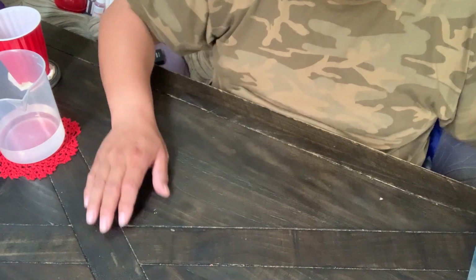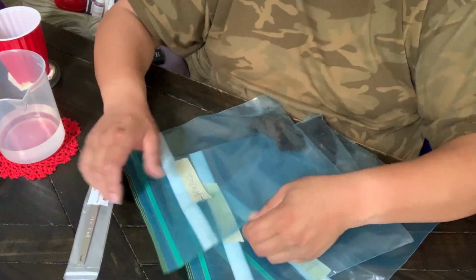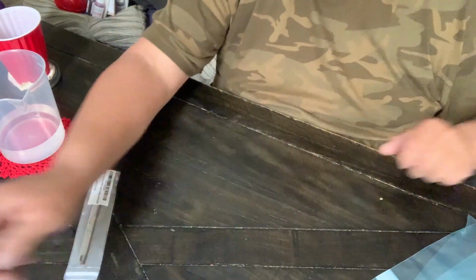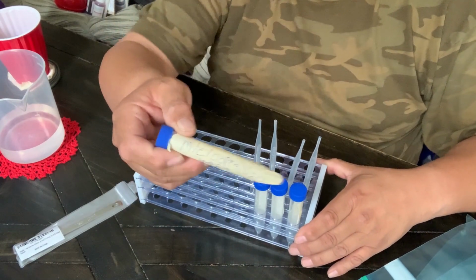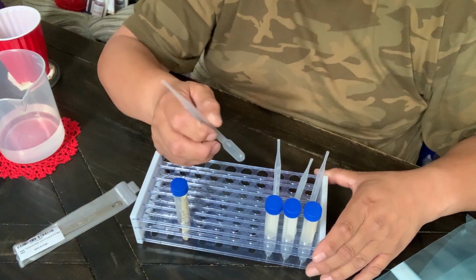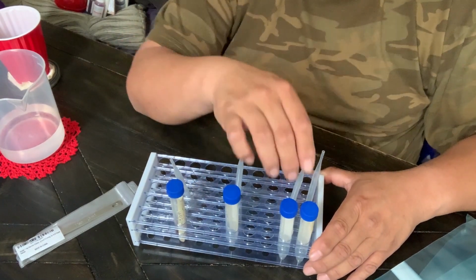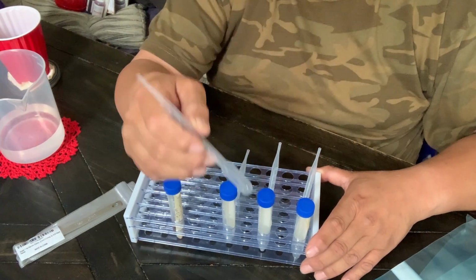Okay, welcome. So we got our soil samples here, and we got them labeled: the grapes, the compost, and the blueberry. And we also have our microorganism water. So basically, the way you do this is you use one of these pipettes for each specimen, so that way you're not cross-contaminating. If you see anybody using just one for all three, you know they're doing it wrong because they're cross-contaminating each one.